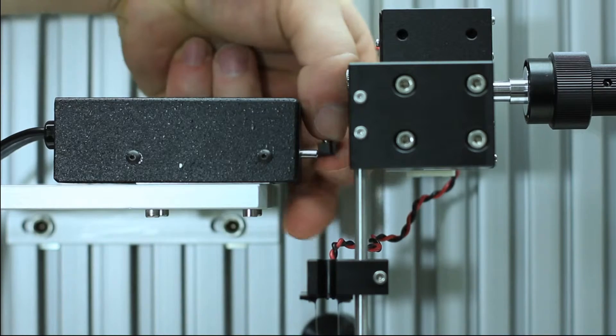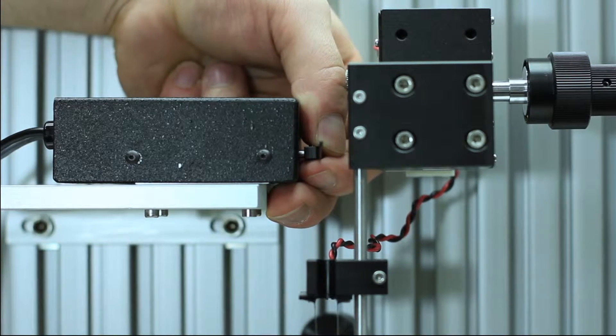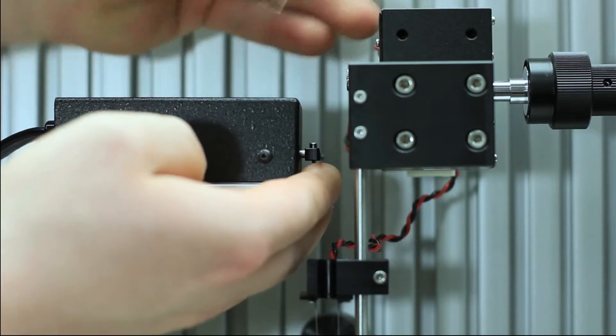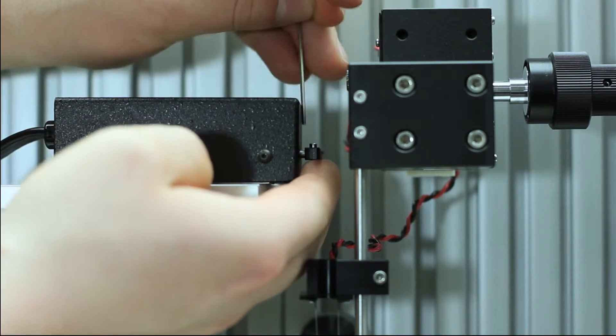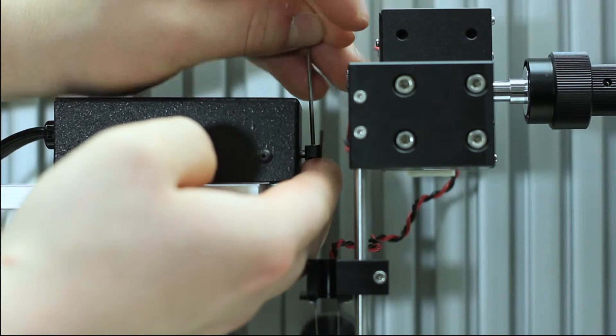Take the lever arm and carefully slide it onto the motor shaft. Leave a small gap between the lever arm and the motor's case.